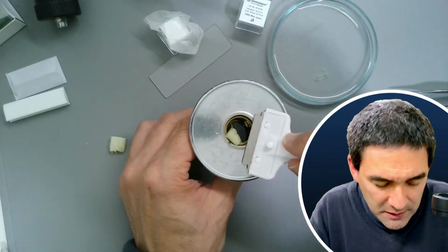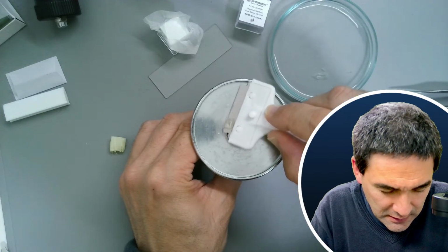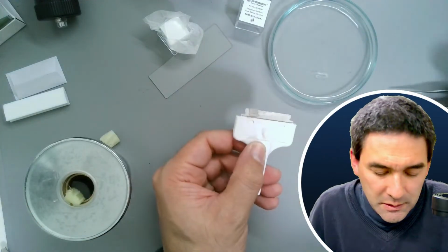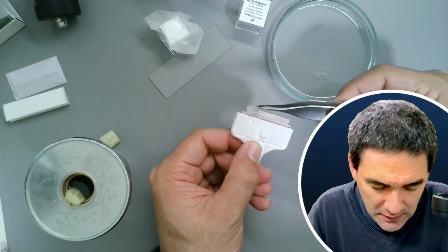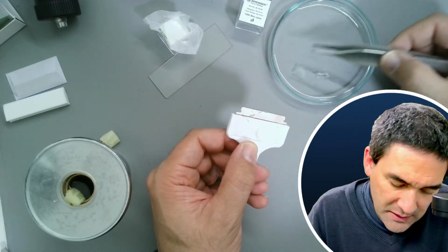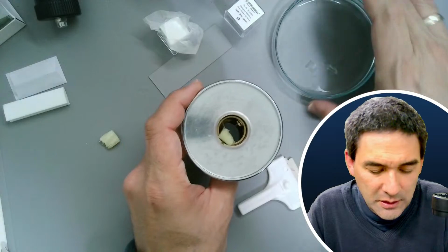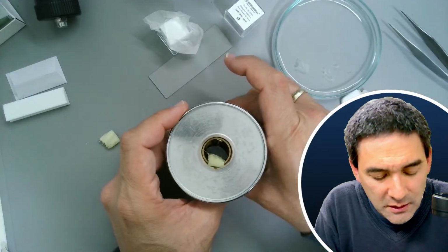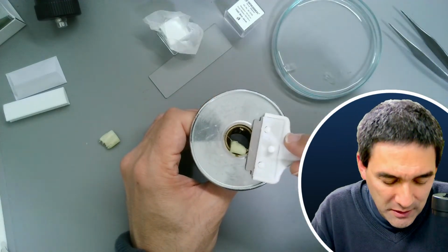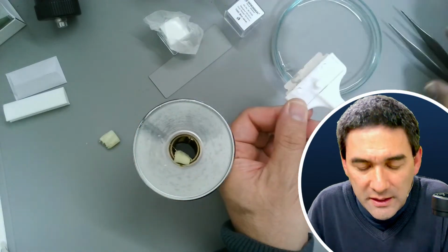Maybe this is still a little bit too big. I don't know if you're able to see this properly. Again here it's pretty thin, and as so often, it's a question of trial and error. The more often you try this, you get a Gaussian distribution curve. This means some are going to be thinner, some are going to be thicker. This one over here again seems to work quite nicely.